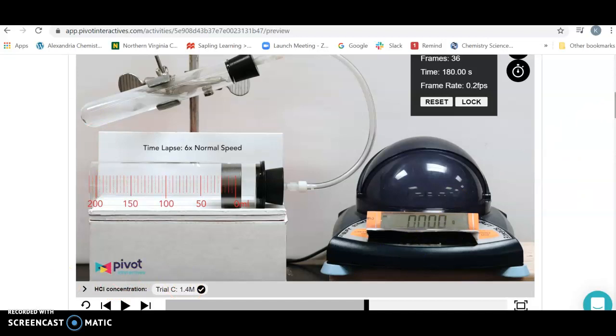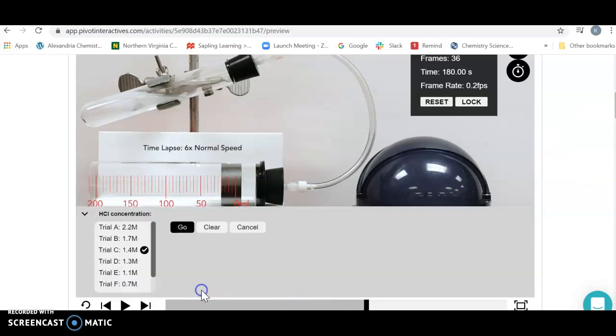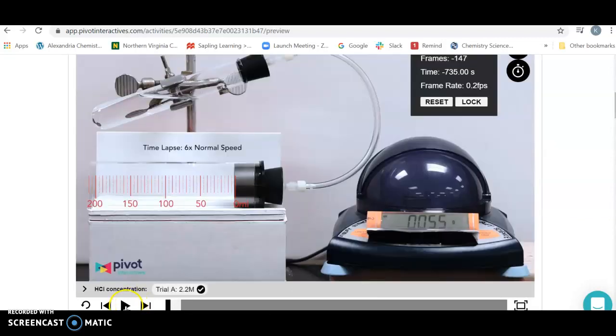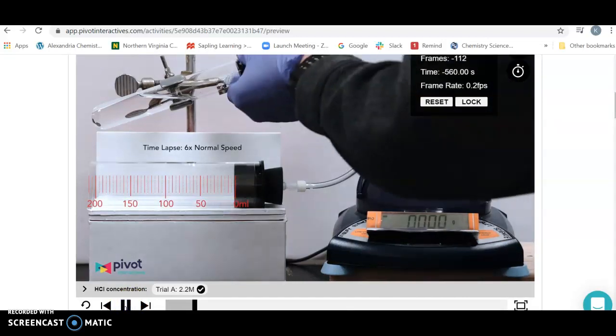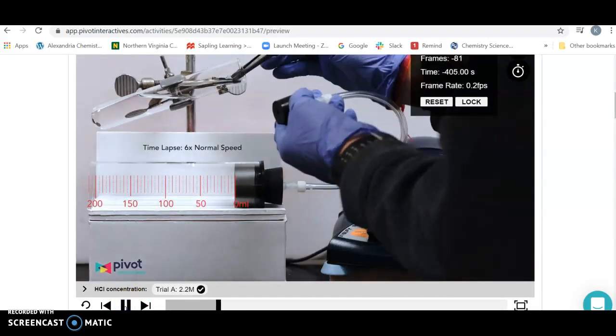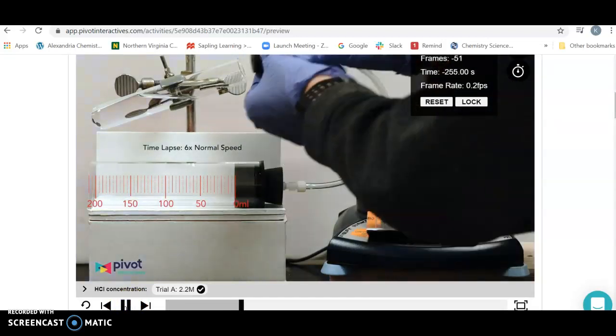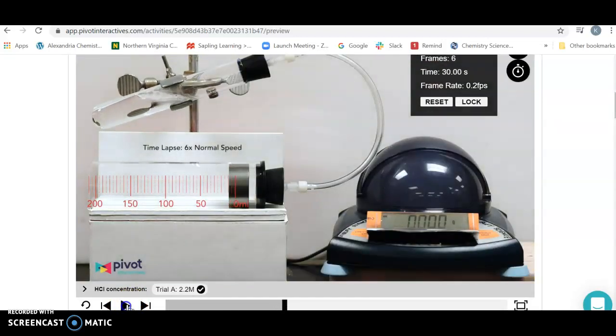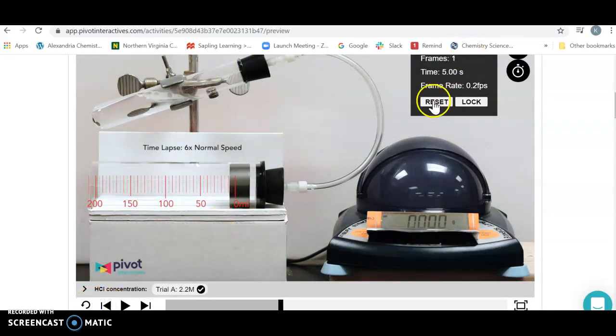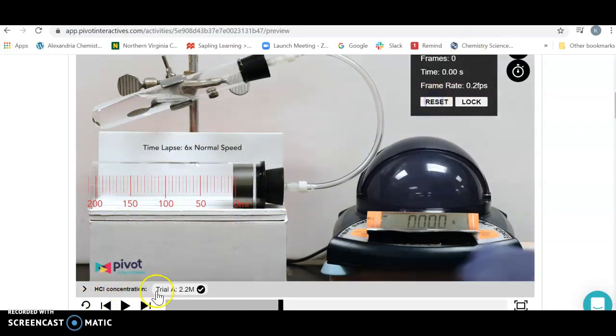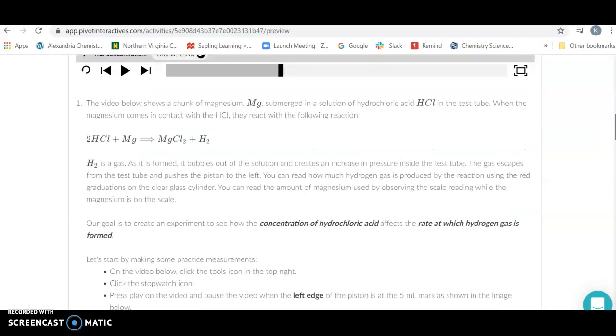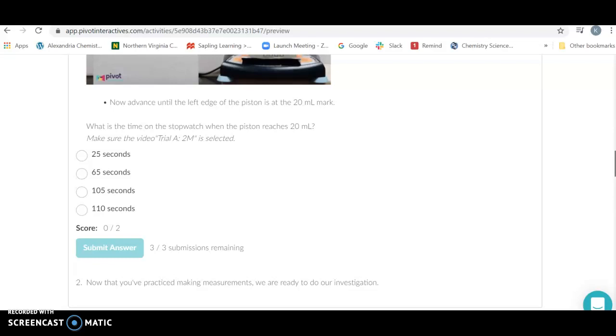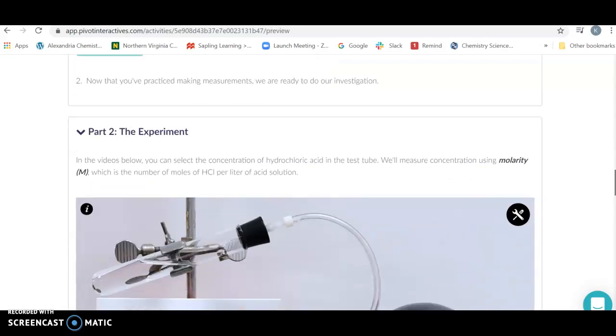Now you're going to do the same thing except at 2.2 molar. Hit 2.2, hit go, press play. Once it pops in and something starts happening, you're going to start at 5 mils. Use this as a fine point, hit the reset button, hit play again, stop when it gets to the 20 mil mark. Answer yourself a few questions and then go on to part two.